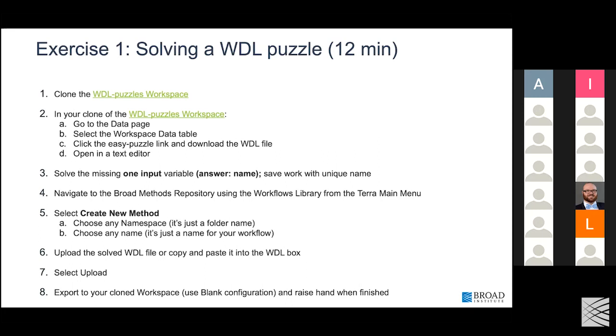Are you asking if you can change the actual variable in the WDL itself? Because you can do both. I just wanted to give you a concrete answer and maybe show an example of it if I can. But if that answers the question, then I don't have to do that either. Do you feel like you got an answer to your question?